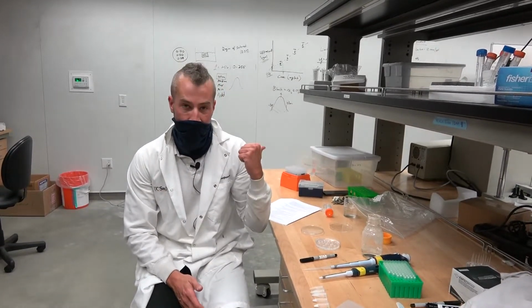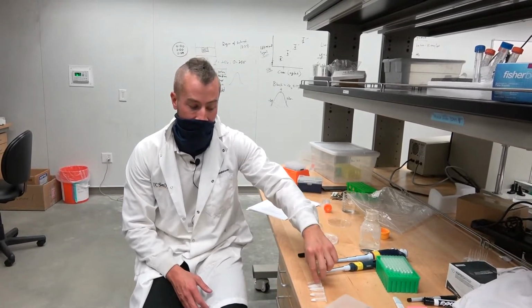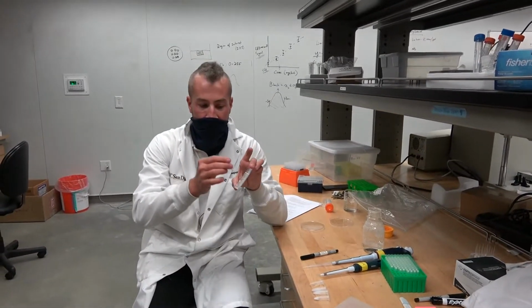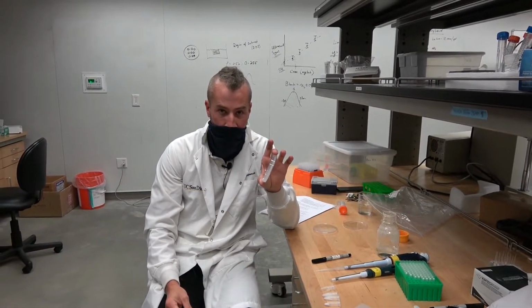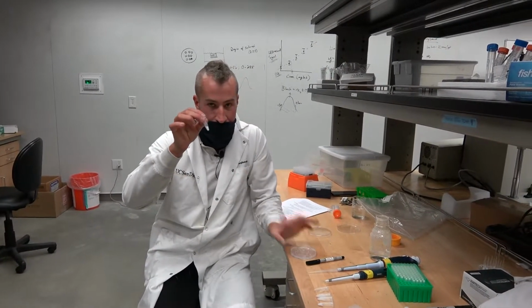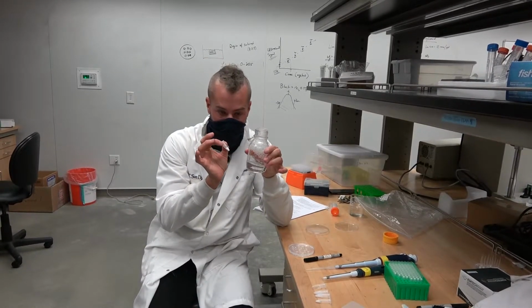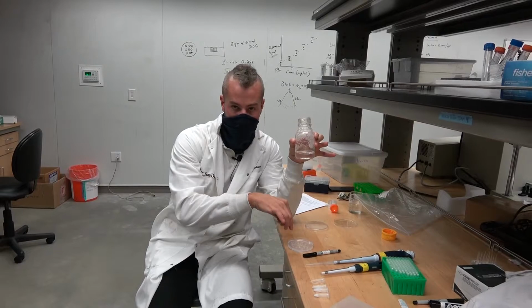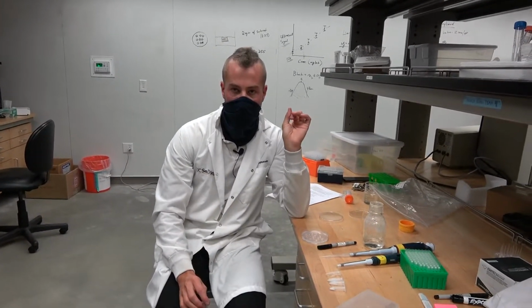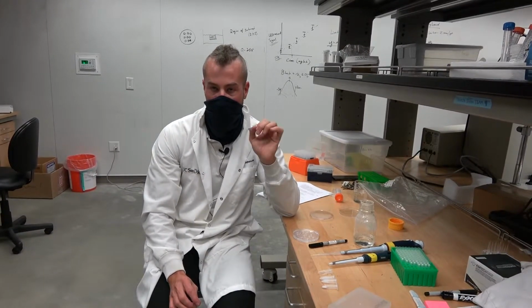The concentrations that you determined over there are going to be cut in half. Because if I take this liquid sample and put it in here, it's going to dribble all over the floor, right? So what I'm going to do is mix my liquid sample 1-to-1 with more hot agar and then put it into the little hole that I made, right? So all the calculations you determined over there need to be cut in half, okay?